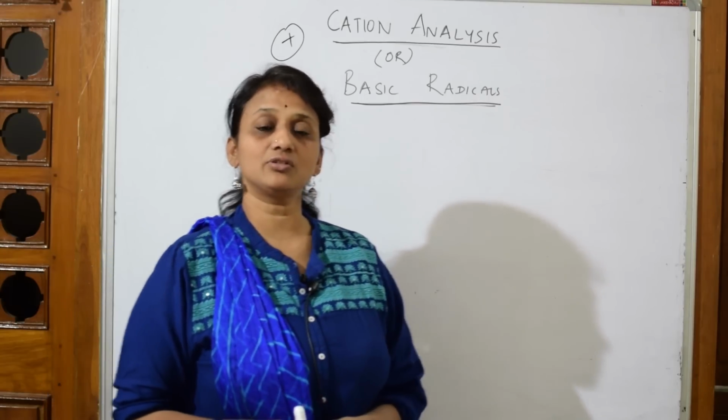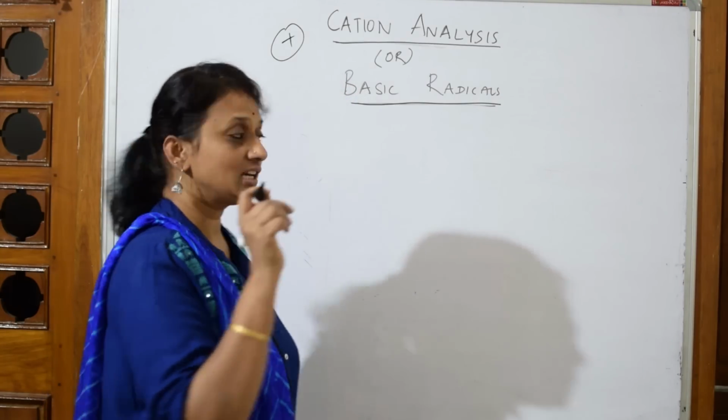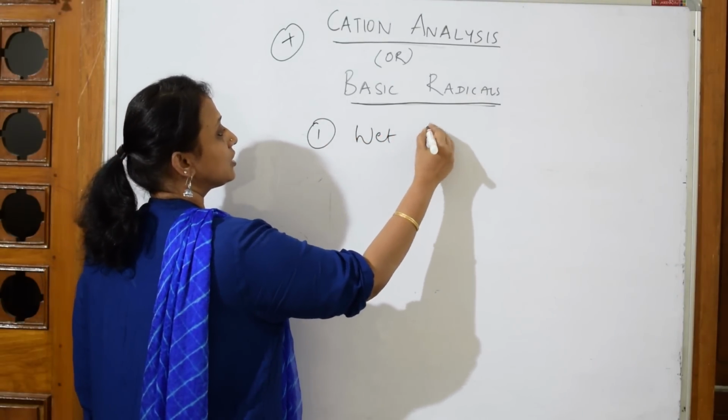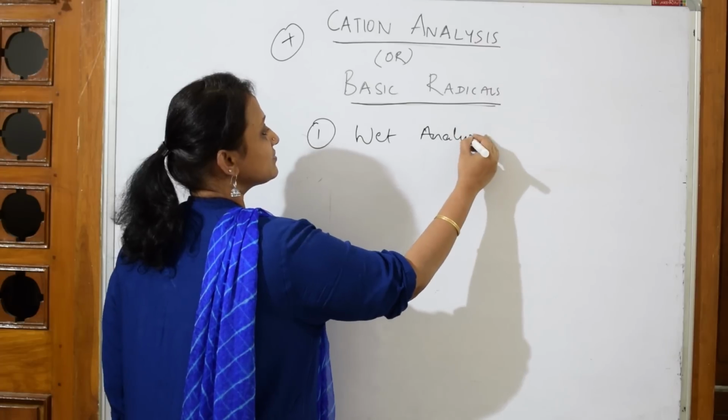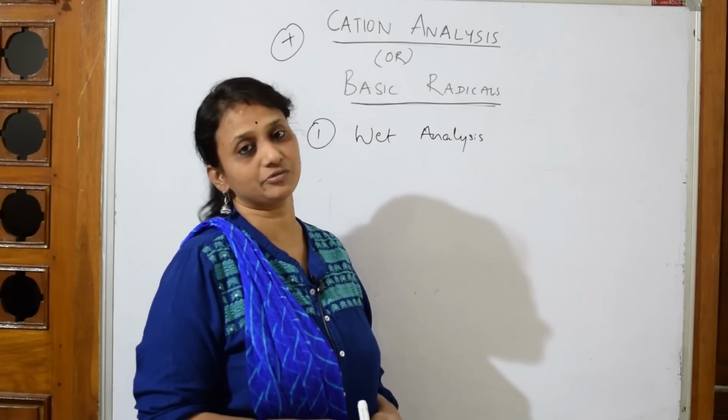When we do the cation, the first important thing you have to remember is the wet analysis. This is the most important thing which you are going to do. So what is this wet analysis? Basically in your wet analysis, you're going to see the solubility of the salt.